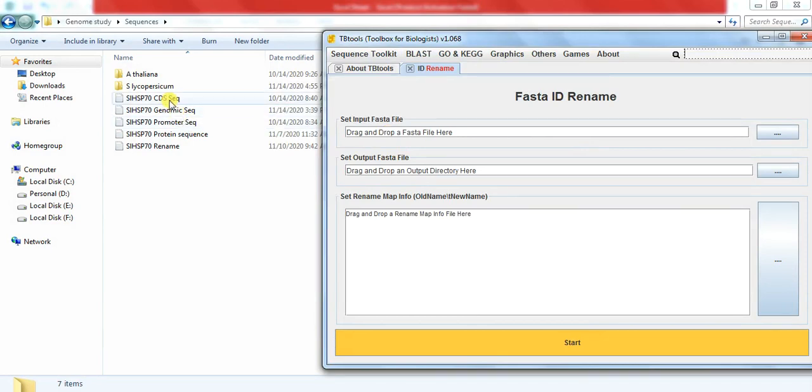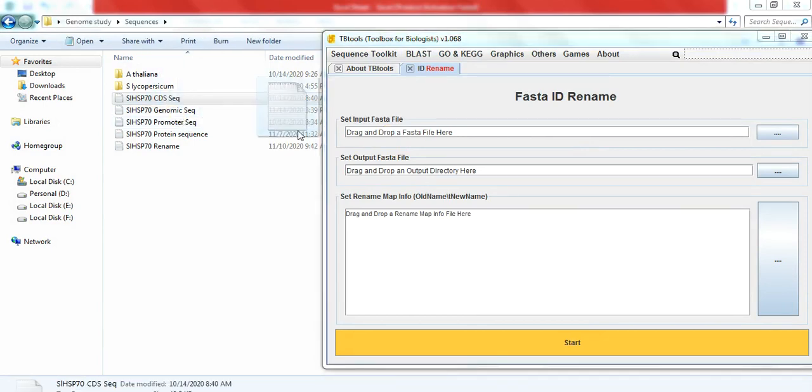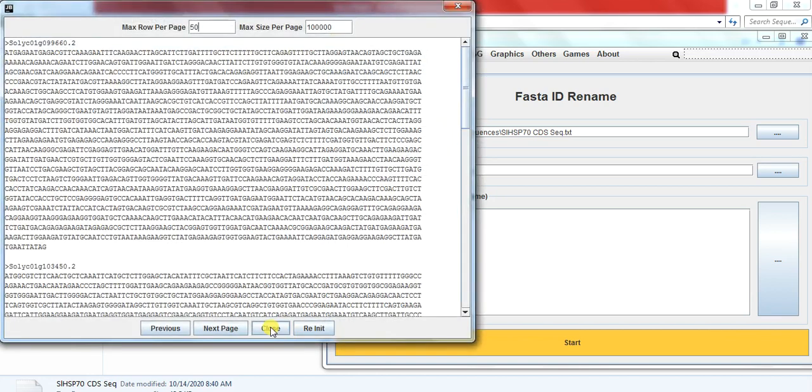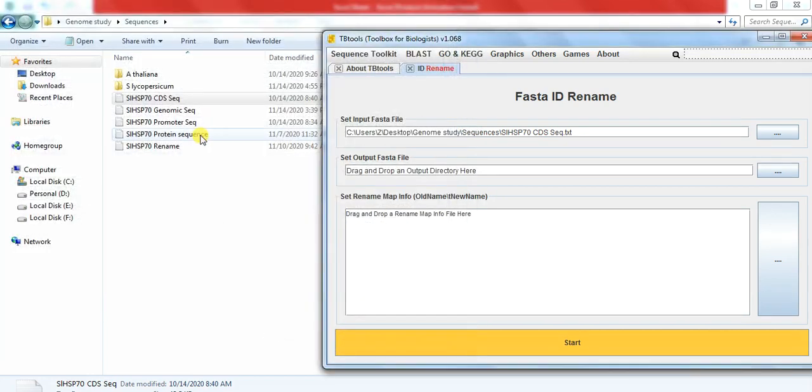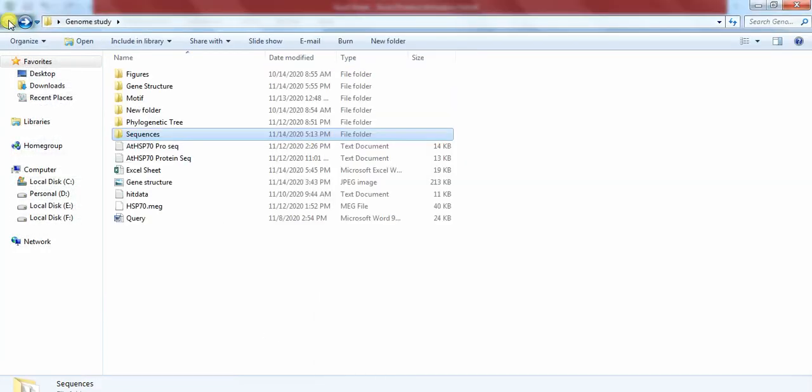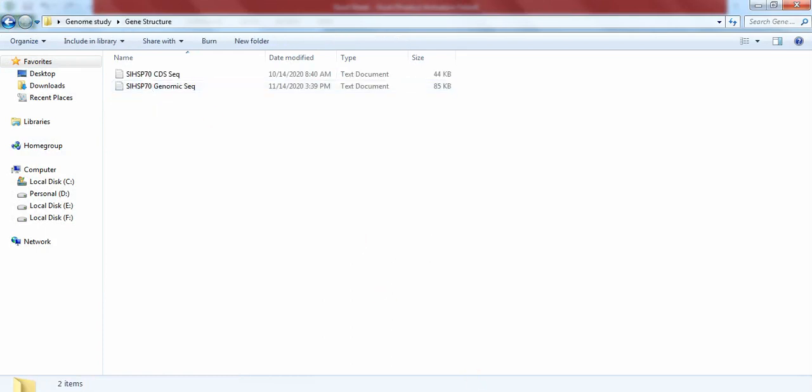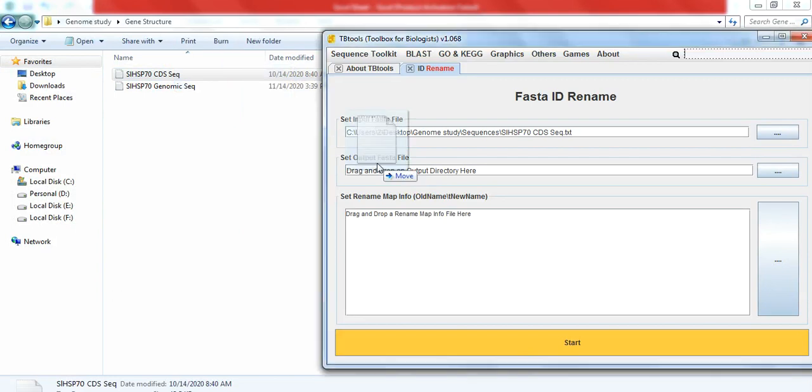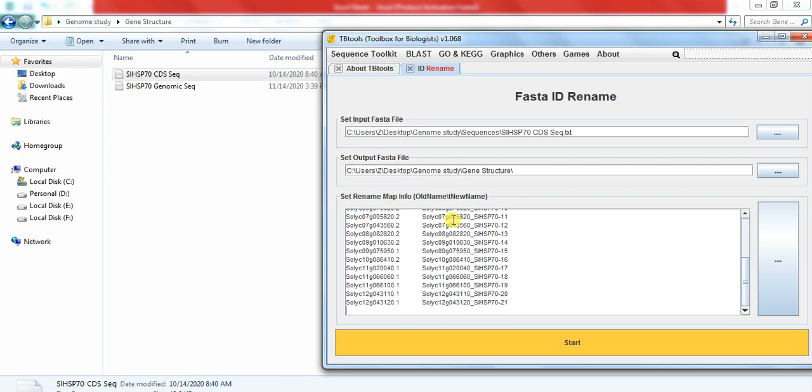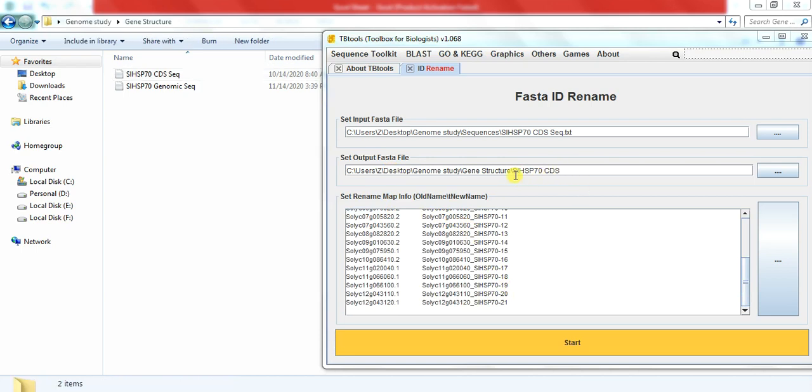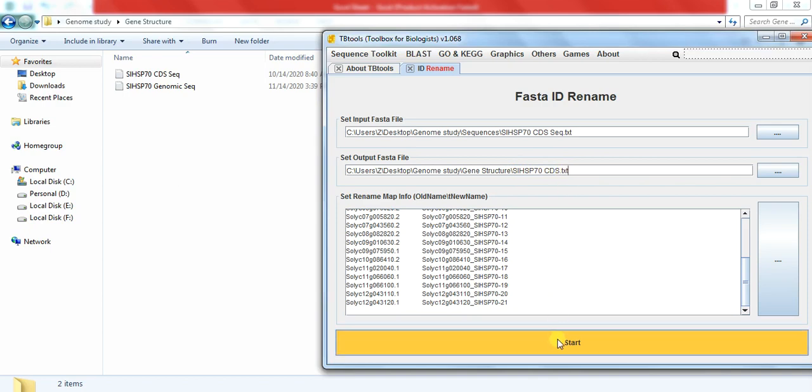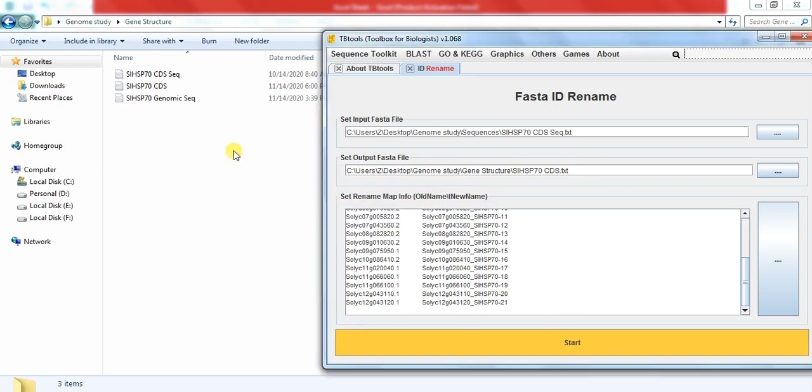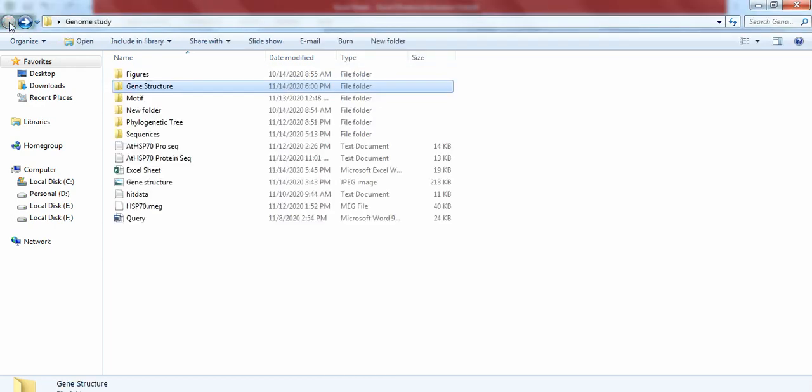Drag this CDS file, close, and we want to save the output file in this folder. Paste your sequences, write the name here and at the end write txt, and start. Rename ID, finish, okay.